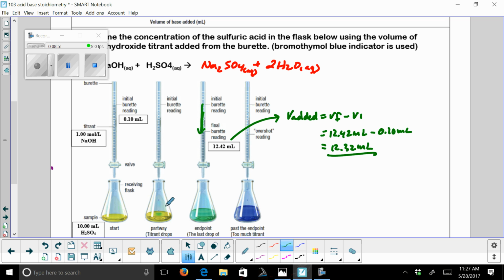Now, how did I know when our reaction was complete? Because we have an acid in the flask and we're using bromothymol blue, it is yellow. As you get close to the equivalence point, you're going to notice that as you begin to add more and more base, there's a little bit of green or even blue color forming in the yellow. That tells you that you're close to the equivalence point. You have to slow down, and then you start adding the sodium hydroxide, the base, drop by drop. When you have a nice equivalence point, you have a beautiful green color. If you add a bit too much base, you're going to have a blue color, so you've overshot, and this is not very good. You want to aim for this green color. That tells you that the amount of base that you added exactly neutralized the acid that you have in the flask.